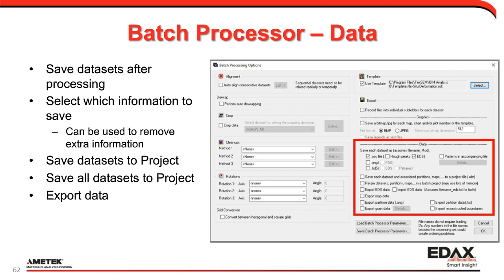So again, this is based on a lot of experience with users of, hey, we want to be able to do this, and then we wanted to be able to do it on more than one sample at a time. We basically built it so you can do it for one sample or you can do it for a batch of samples. And when you have a batch of samples, you start loving the batch processor.